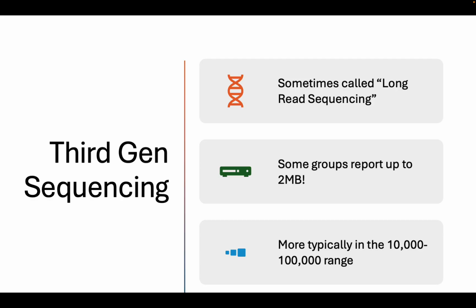But with Sanger sequencing, it takes a long time to get that many bases and to assemble a whole genome. With the short read, you can do the whole genome on one run. So pros and cons. This long read sequencing, this third generation, is really trying to address the pros and cons of the first two generations, right? Why would you come up with a new technology if it wasn't going to be an improvement?